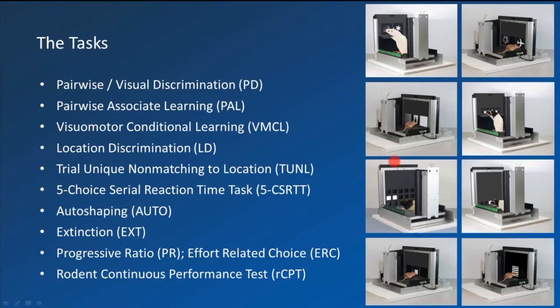To start with, a sample position is lit, and that's followed by the same sample along with a new position being lit, and the correct response is then to the new position. And because that new position can often be either side or below or above the sample one, the rodent cannot use mediating strategies to help them remember, making this a working memory task.